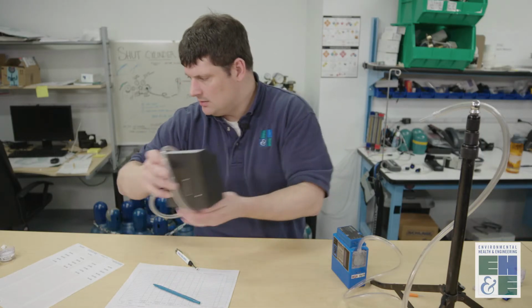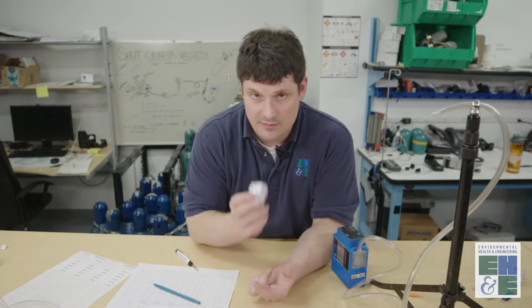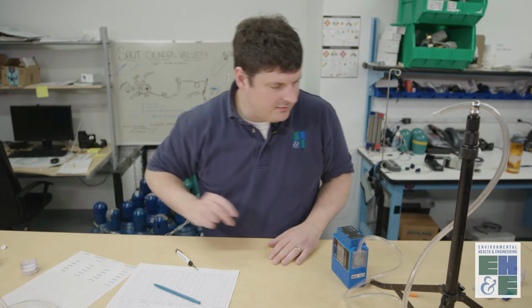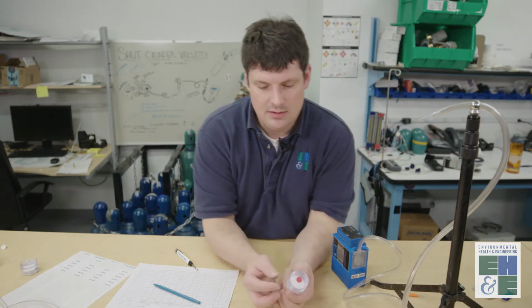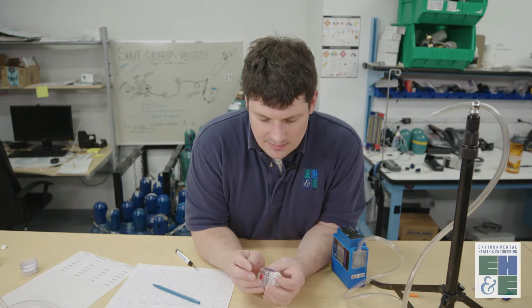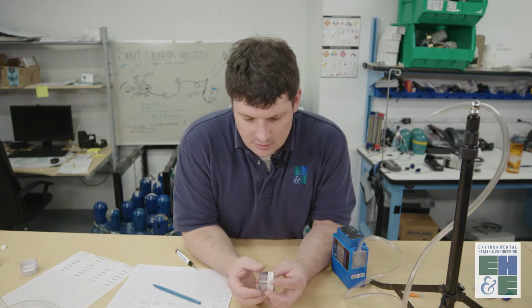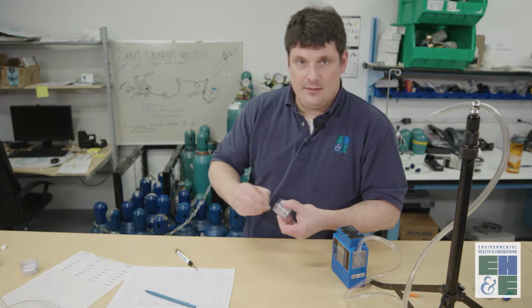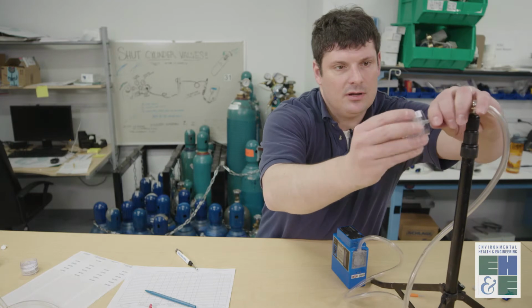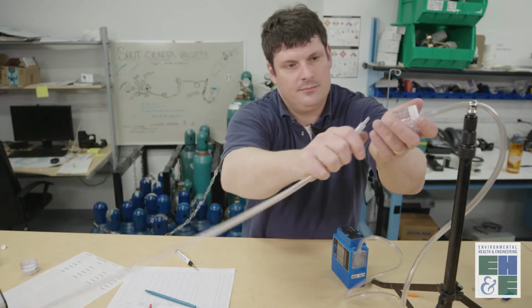We just sampled what was a two-piece 37mm cassette, which required the lower adapter. We could also sample with a three-piece 37mm cassette, depending on the project plan. These samples are often collected what's called open face. So when we're setting our flow rate at the beginning and to collect the off flow, we have to leave this cap on, and we would take our flow measurements like this.